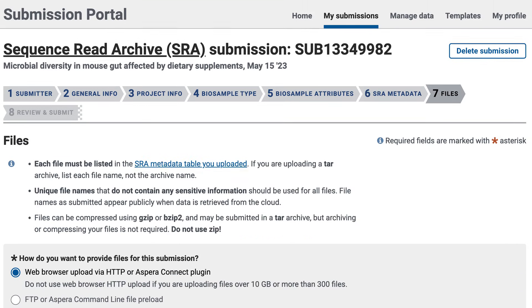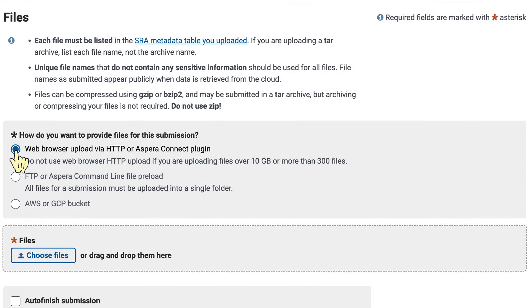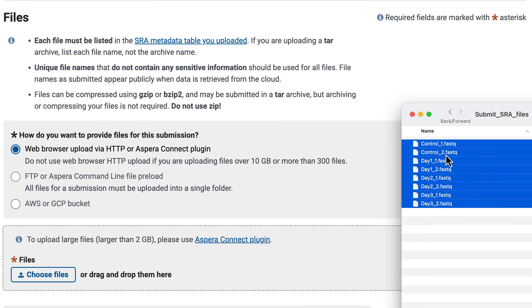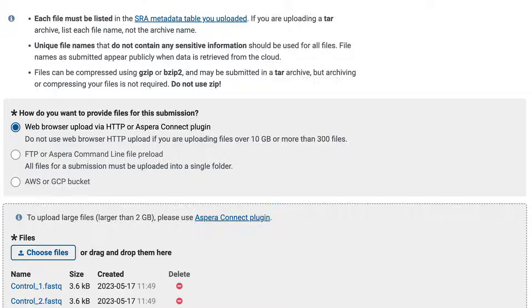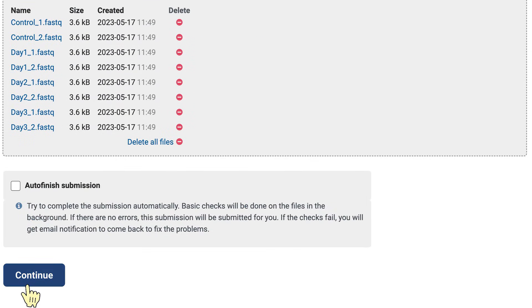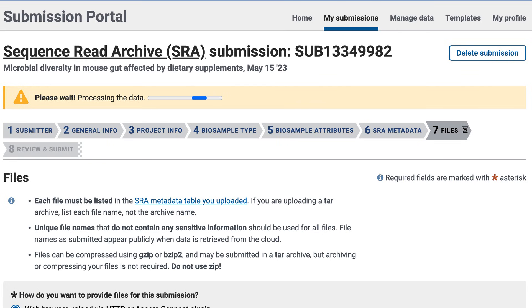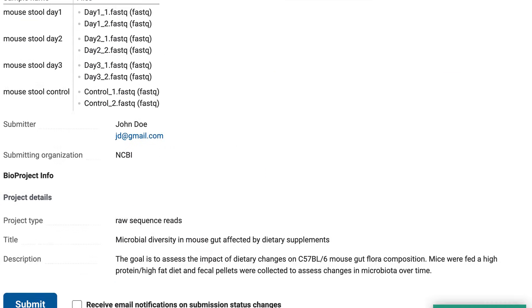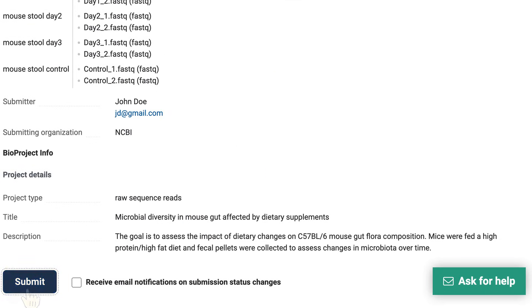I'm now ready to upload my files. I'll choose web browser, which will allow me to drag and drop files. But choose other options if you have large files or many files to upload. I'll click Continue, and I'm now at the last page: Review and Submit. This is your chance to review your submission and make any changes. When ready, click Submit.